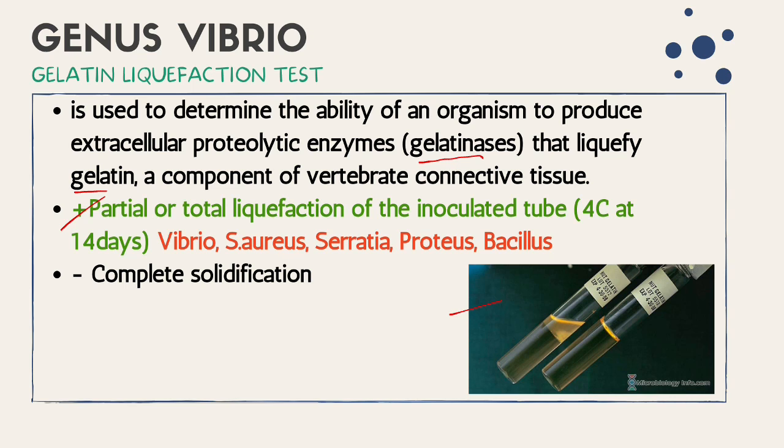For positive organisms, we have Vibrio, S. aureus, Serratia, Proteus, and Bacillus. Negative is the complete solidification, just like here in this picture.